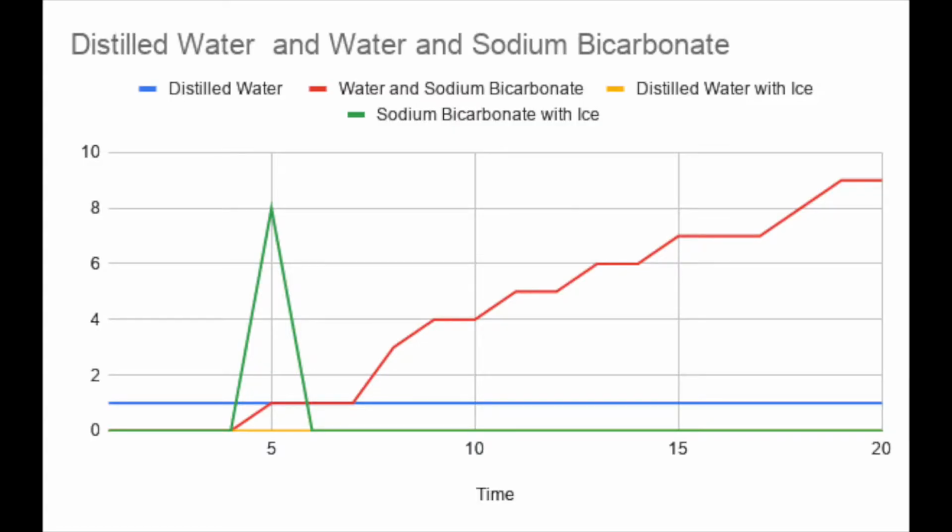The third group we decided to compare data with used ice water in order to determine how many discs would float. The ice water caused 0 leaf discs to float within 20 minutes. The ice water did not allow for a sufficient amount of light to pass, and the cold water caused the enzymes to move at a slow rate. This slow rate results in fewer discs making it fully through the photosynthesis process and floating. As the temperature of water decreases, so does the rate of the reaction. This is the reasoning behind 0 discs floating within 20 minutes.